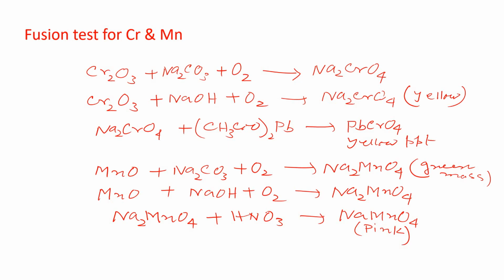So now we have completed all the preliminary tests for the salt. From these preliminary tests, you will get some idea about the cation present, especially from the special test or fusion test for chromium and manganese. It is almost the confirmatory test.